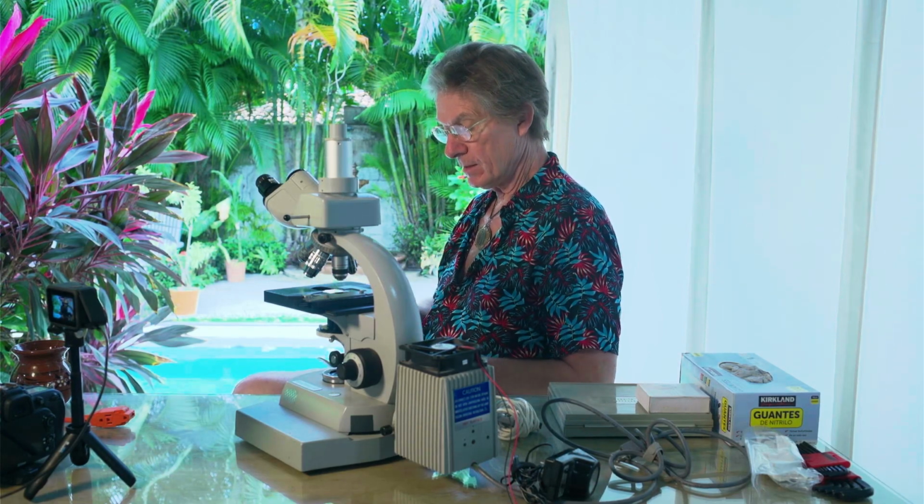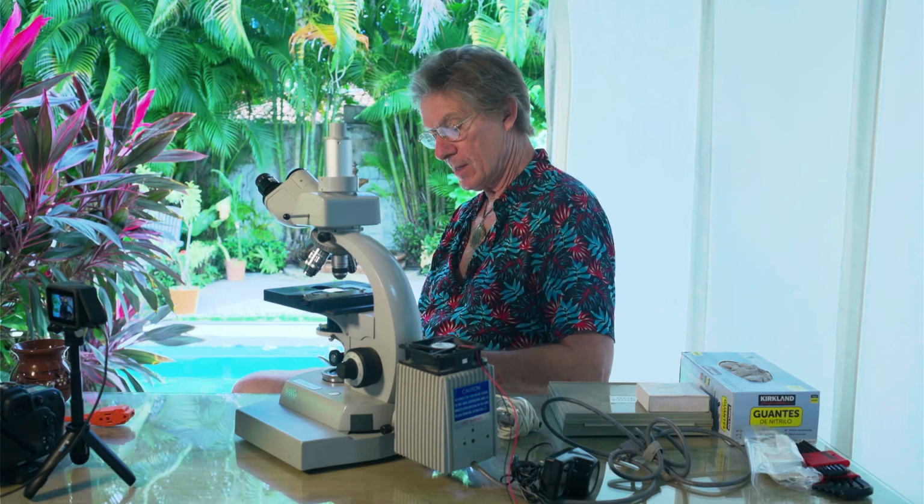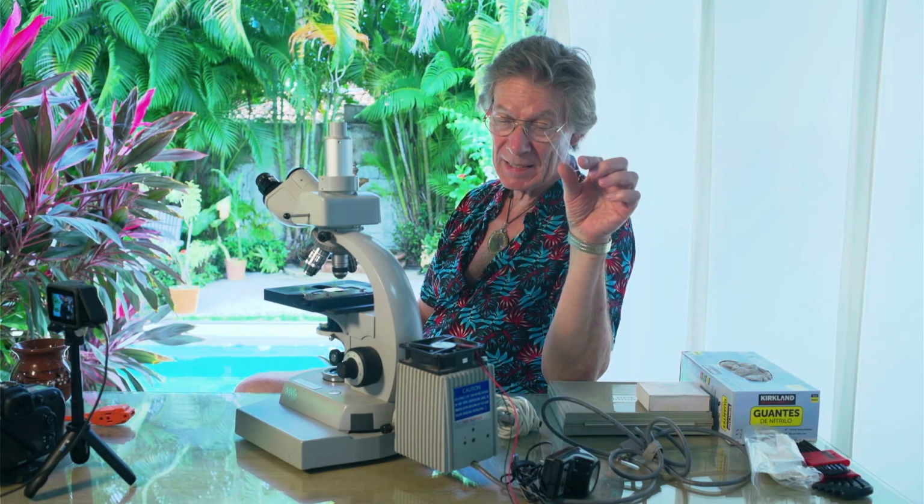But an artifact is basically something you don't expect to be there or isn't normally there. And one of the things that I have done is extensive, over 1,000 hours of research on eliminating artifacts. Why do we want to eliminate artifacts? Well, an artifact showing up on the microscope slide is something that's not supposed to be there. Let me repeat, it's not supposed to be there. It's not part of the client's blood.